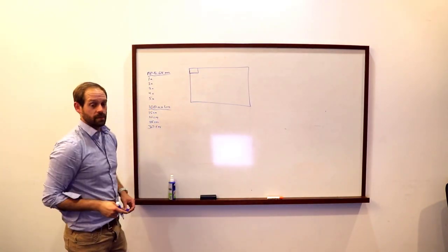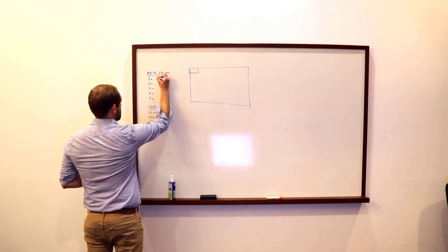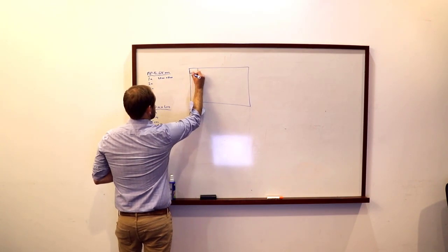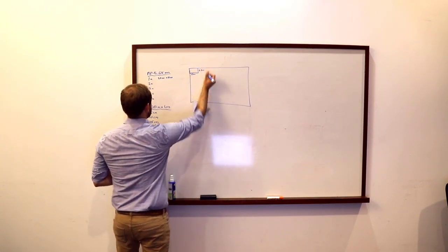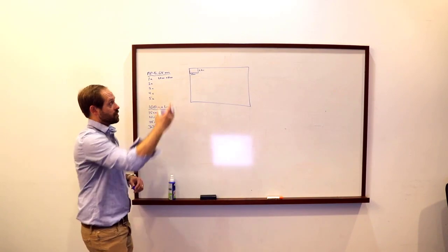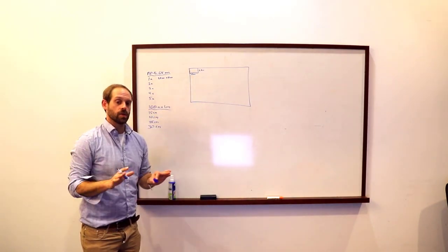Now this number I'm speaking out arbitrarily. However, let's say that the 1x is 2.5 millimeters by 5 millimeters. So our long axis is going to be 5 millimeters and the height of the field of view is going to be 2.5 millimeters. We can't just program that into the amount of translation in the system, because there will never be informational overlap for the software to generate and merge two images.